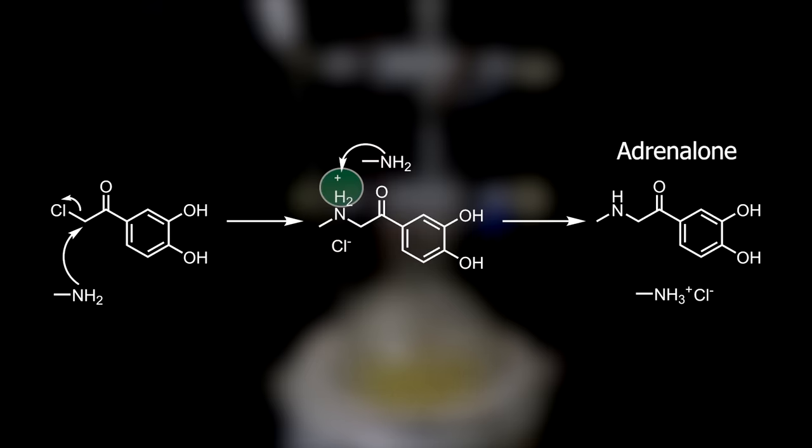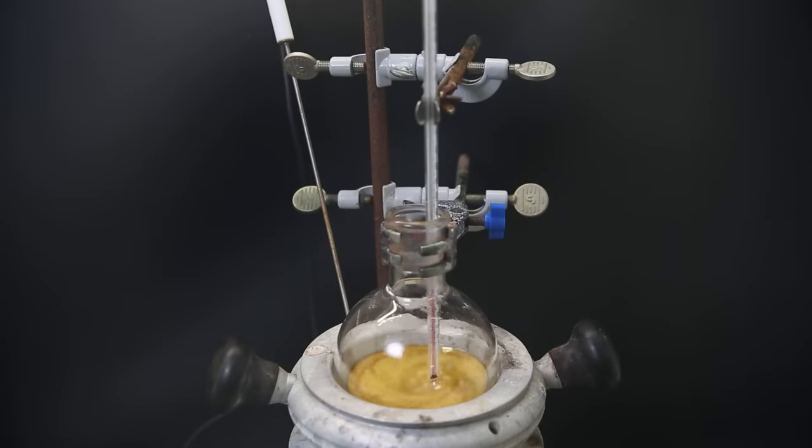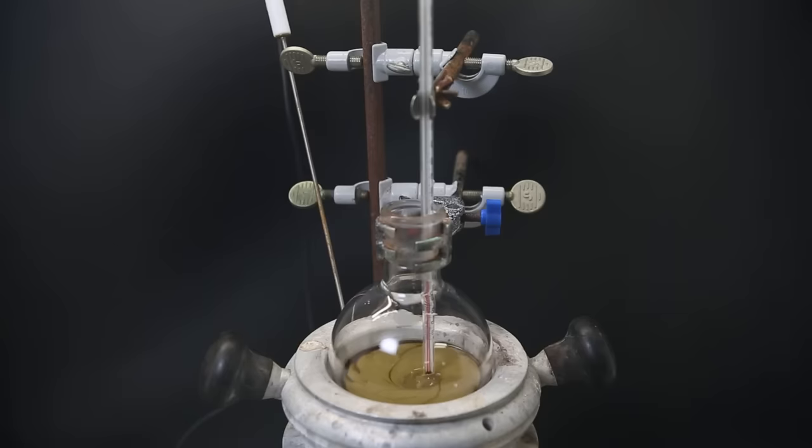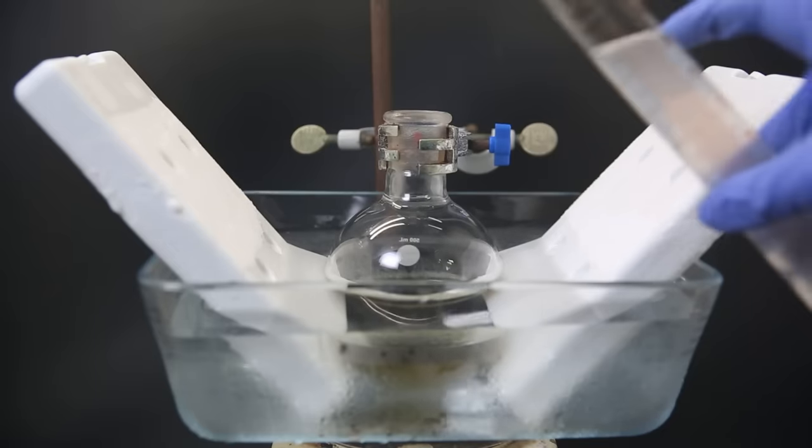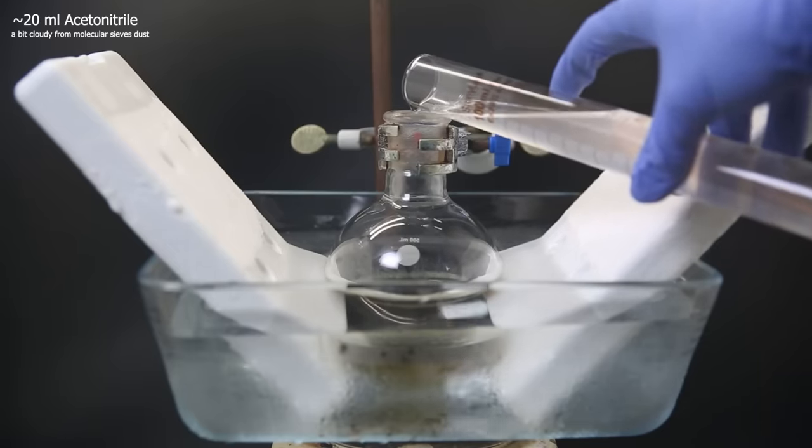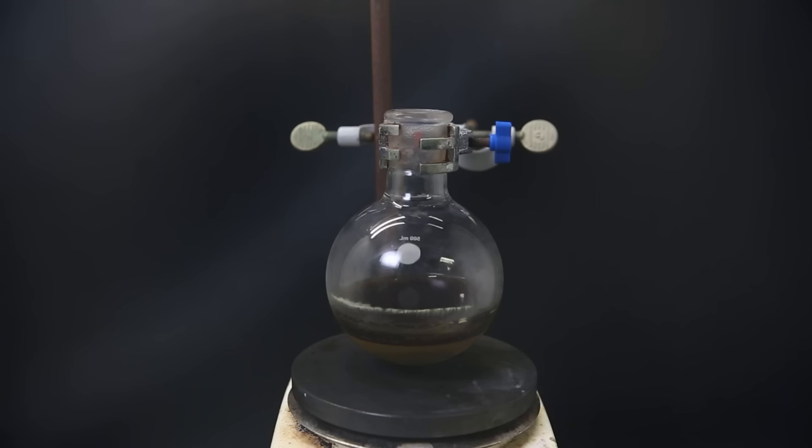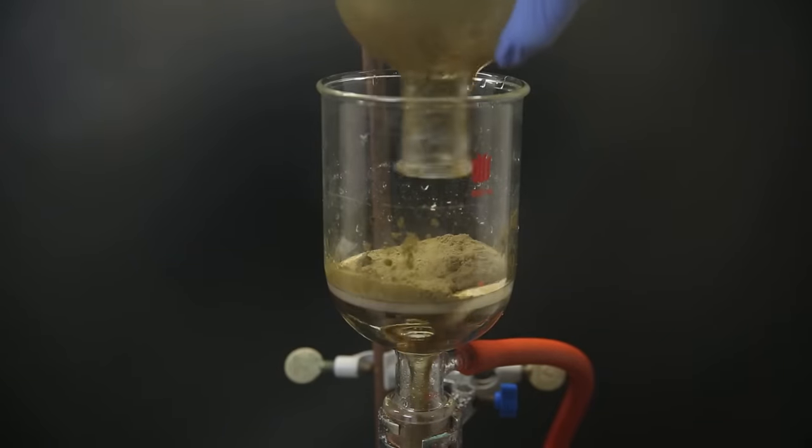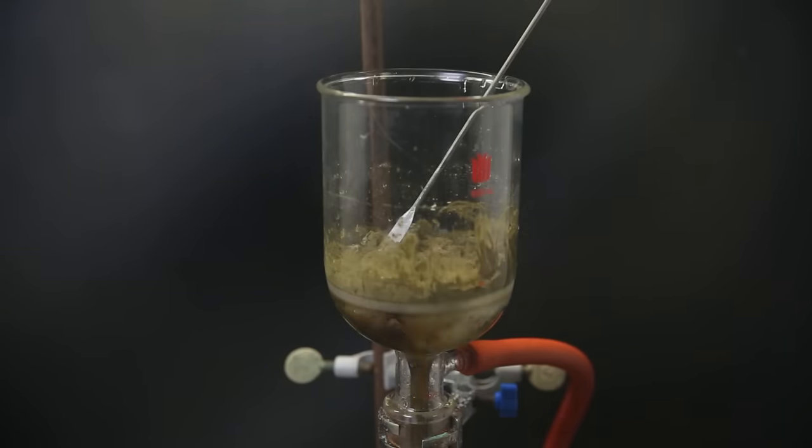At first the reaction was green, and after a while it became yellow, and in the end it was brown. I then move it to an ice water bath again to cool it down to a bit below room temperature and add in some more acetonitrile. Since the product is insoluble in acetonitrile, I then vacuum filter the mixture through a glass frit with a filter paper on top and wash it with some more acetonitrile.